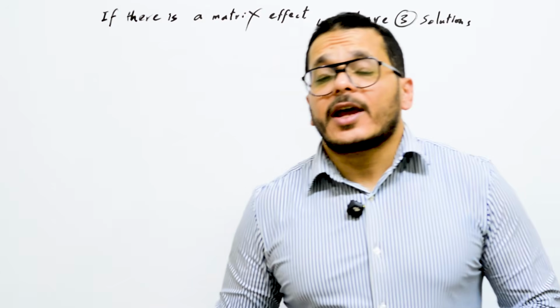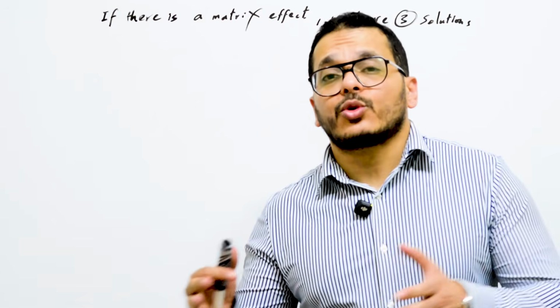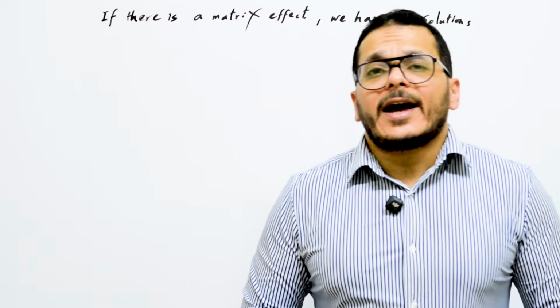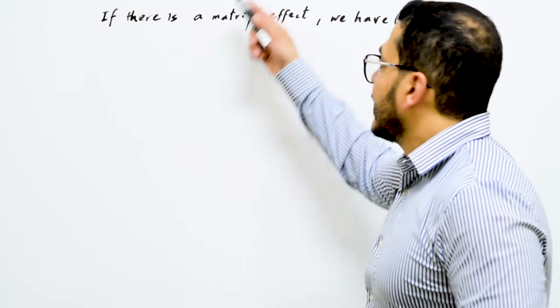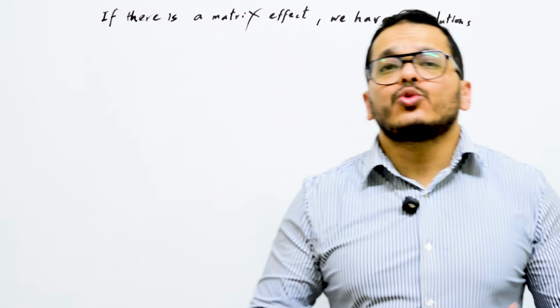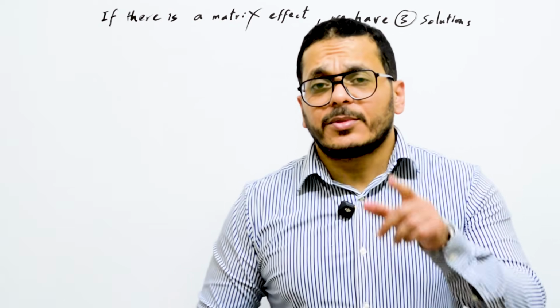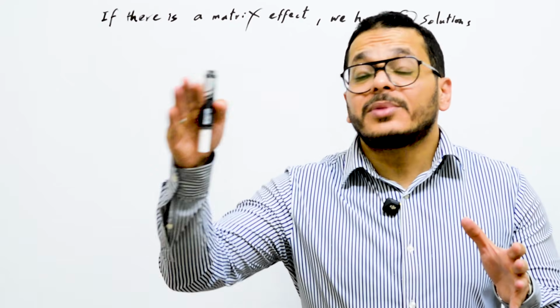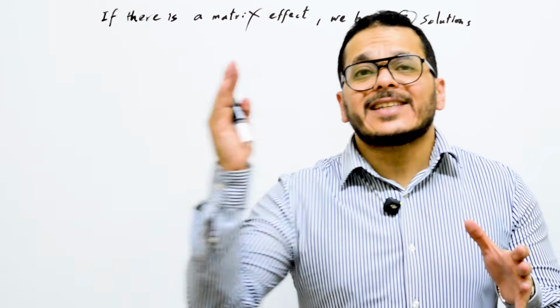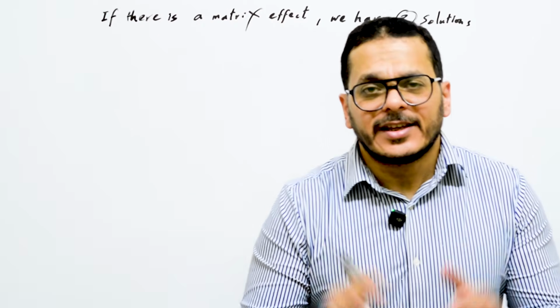In the previous lecture, I explained how to prepare calibration standards, whether from liquid or powder standard, and also how to select the calibration levels. In this lecture, I will explain the matrix effect and what you can do if there is an effect from the matrix on your target analytes. But before that, you should know that to verify that your calibration is accepted or not, is accurate or not, you should run a verification standard with every sequence.